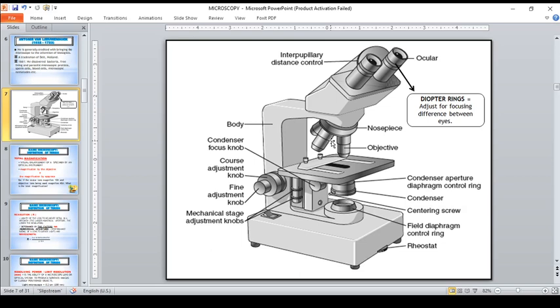And what is the color of the band present in the scanner? Di ba meron siyang kulay here? May kulay siya that would identify what type of objective that is. That is red. Pula.